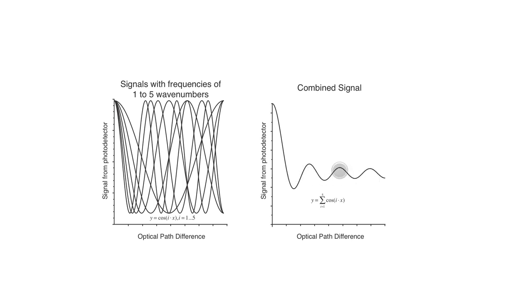Look, you need at least a couple of oscillations to get the frequencies. So you need to measure this sort of tail as it goes out, as you move the mirror, as the optical path difference changes. The sum of those frequencies starts strong, gets weak real fast, stays weak. We're measuring. This is the key part here to measure. The more of that we can measure, the more information we're going to get out of the spectrum.